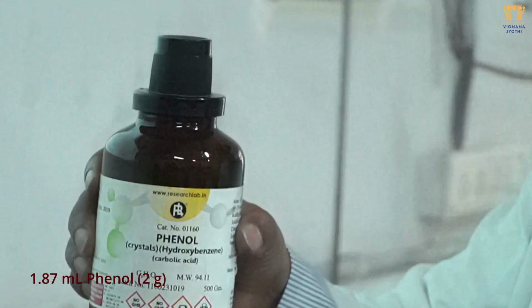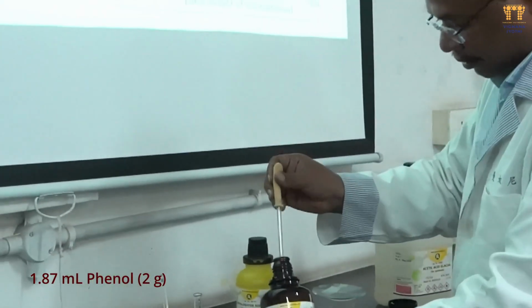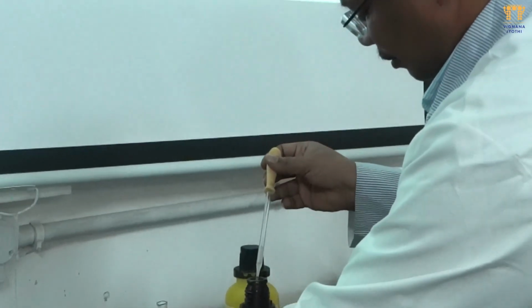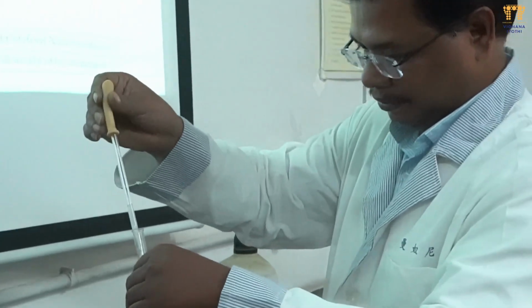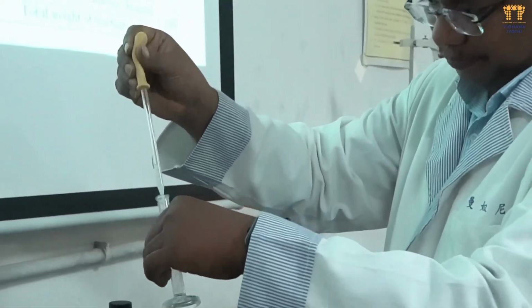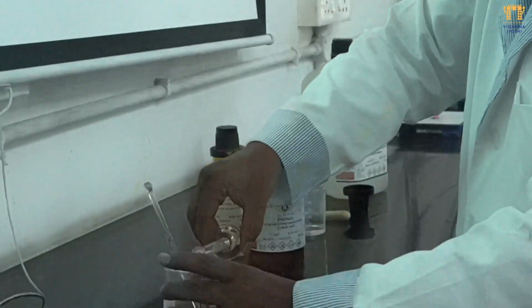Then we can add phenol, 2 grams of phenol. It is almost 1.87 ml, so nearly 2 ml of phenol we will take into the measuring jar. Then we can pour it into the beaker, which already has the formaldehyde solution as well as the glacial acetic acid solution.